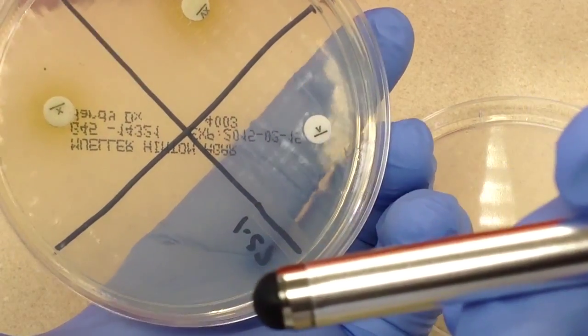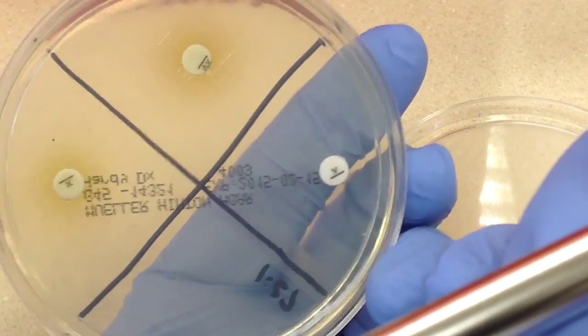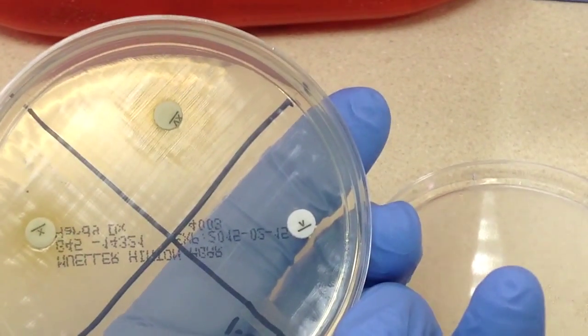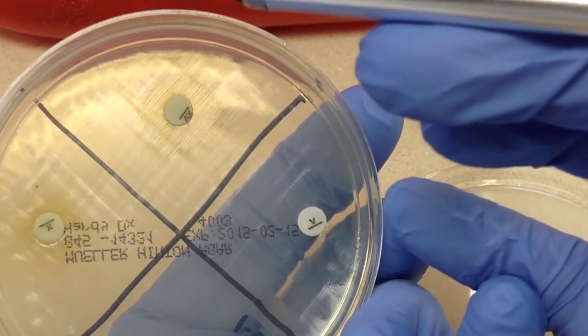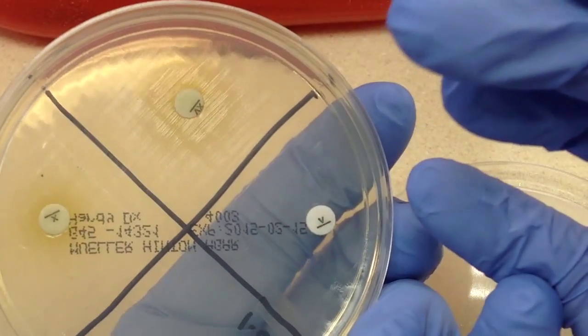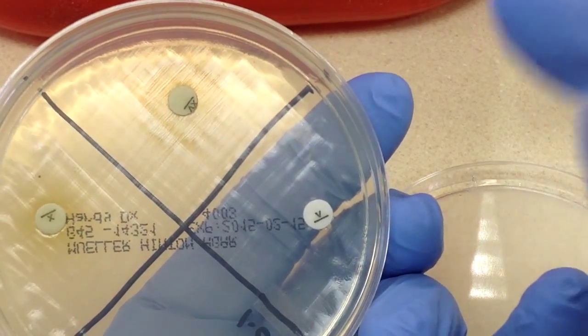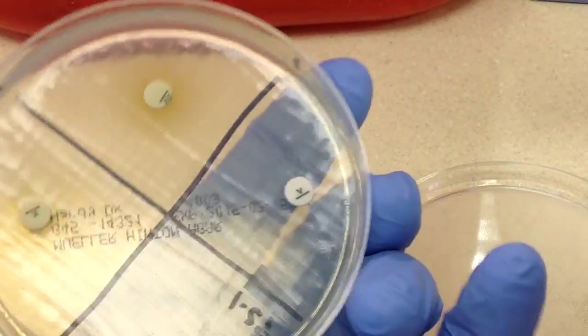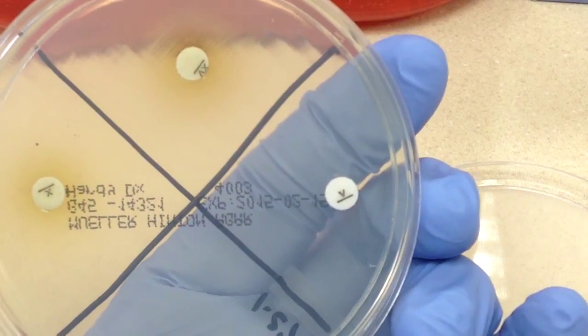And with Haemophilus influenzae, it needs both. So now I think we can see that around the X and V disc, excuse me, there is this round haze. And that is what we're looking for. So this test has proven or shown that what's on this plate is Haemophilus influenzae.